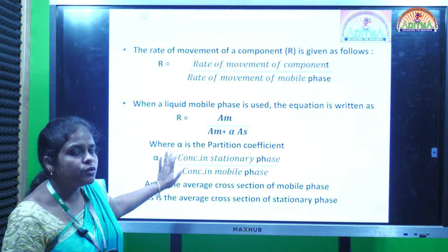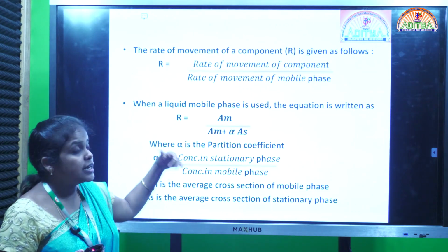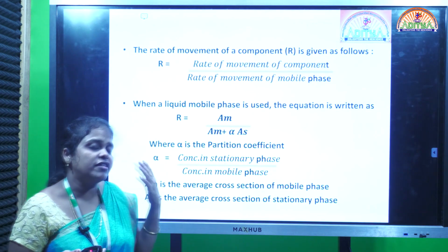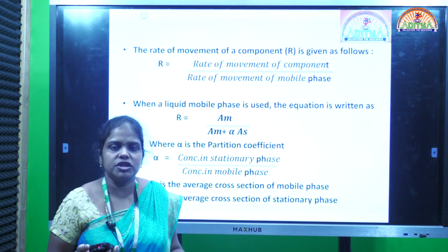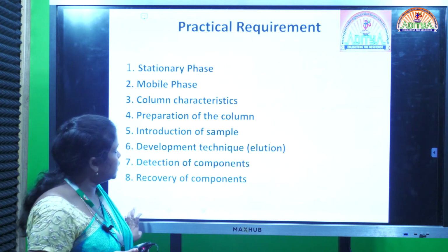This formula we use whenever we are using a liquid mobile phase and liquid stationary phase, and the earlier formula we use whenever we are doing adsorption column chromatography. These are all the things behind the principle.